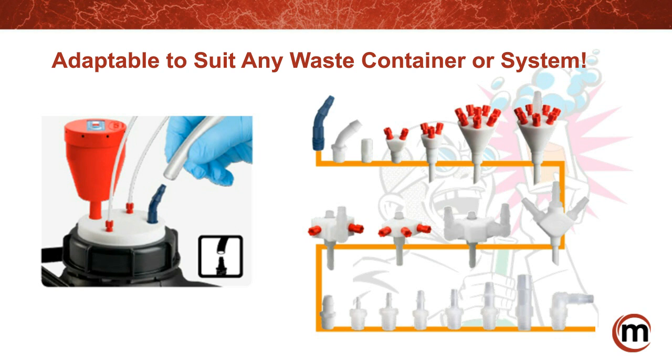Here's a couple-part question, so I'll start with the first one. How do we protect ourselves from rinse solution and rinse reservoir? So, I'm not sure exactly what that question is asking, but we do have other closures. I haven't mentioned it in this presentation, but we do have other closures that could be meant for not just waste containers or solvent bottles. We have things for graduated cylinders, a bunch of other stuff as well. I probably need a little more clarification on what that means, but we do have other things.